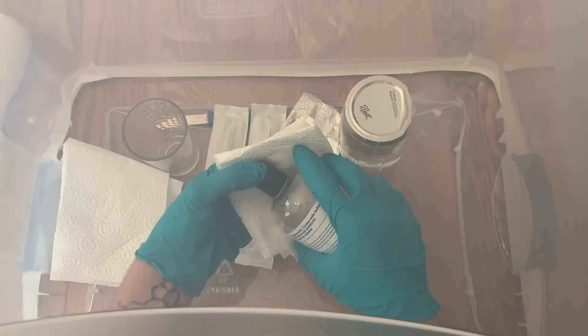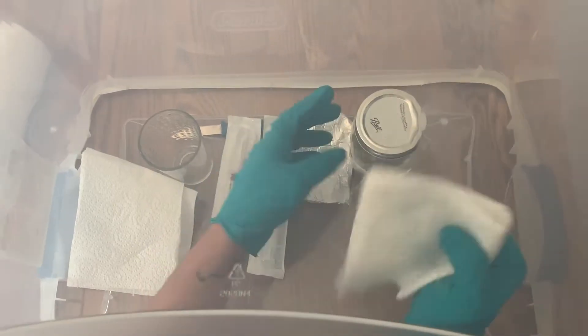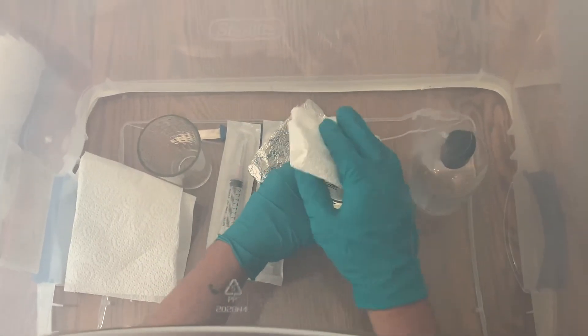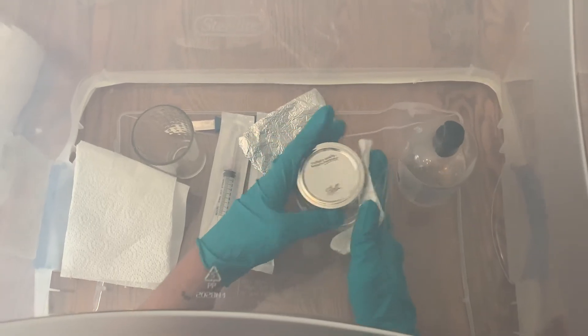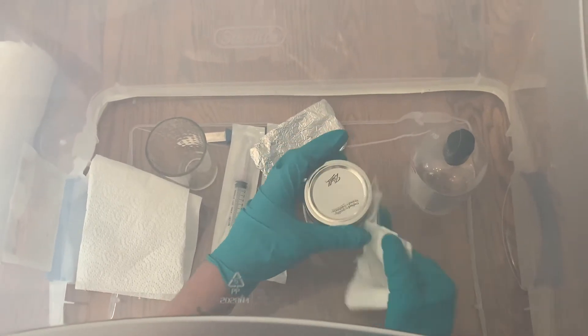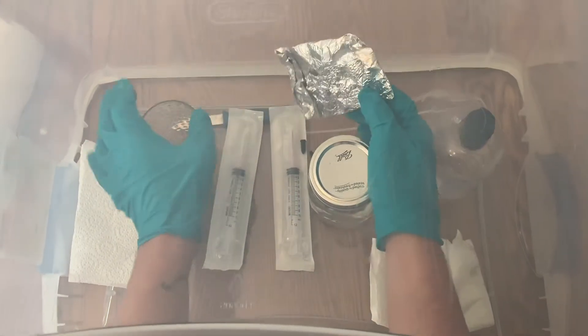Welcome back to Spore and Sprout. In this video I'm going to teach you how to make a spore syringe. This will come in handy if you find a wild mushroom and you want to cultivate it yourself. You can take it home, take a spore print of it, and then make your own spore syringe.